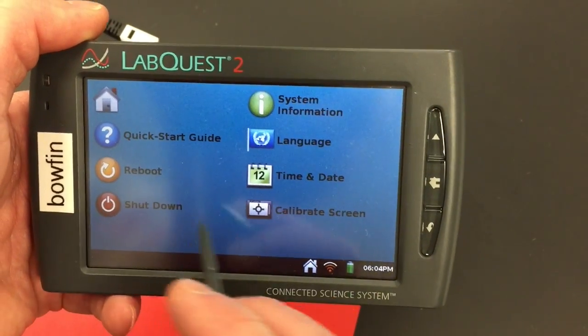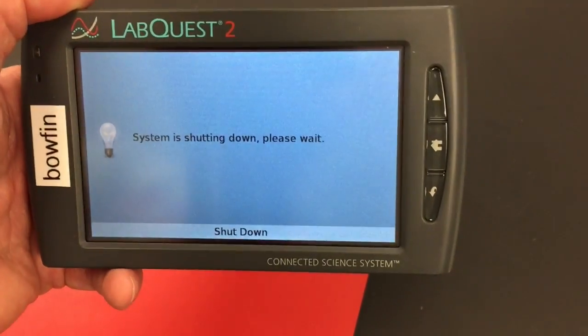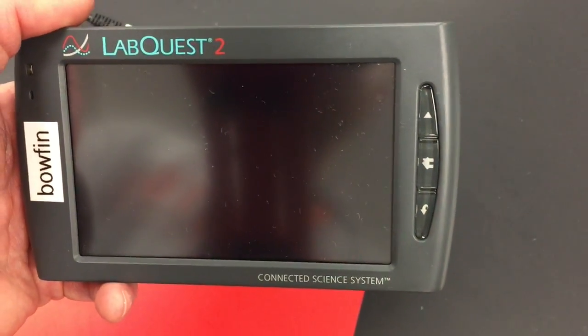Then hit the home button, system, and shut down. And that's the best way to shut it down. Anything else is just going to put it in standby.